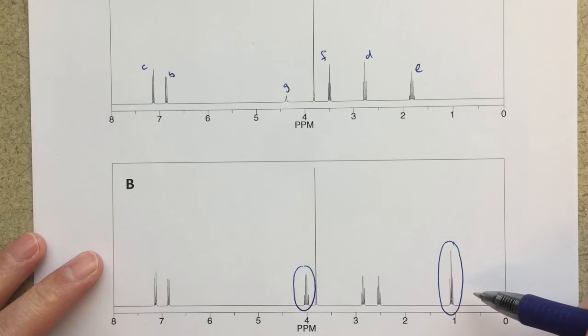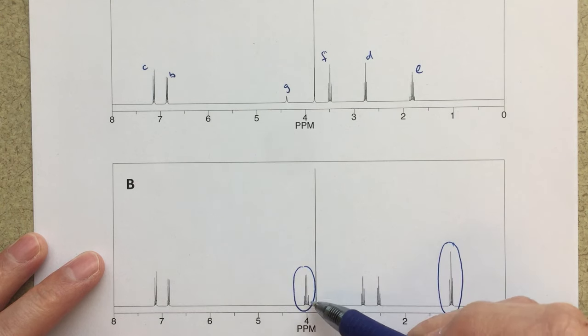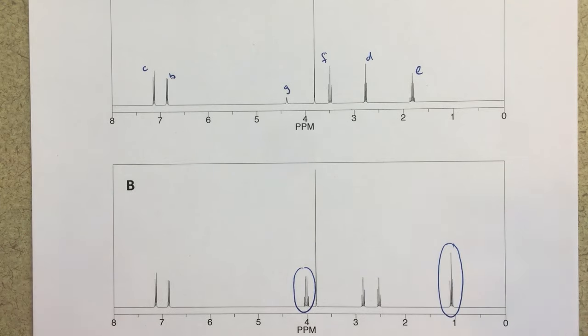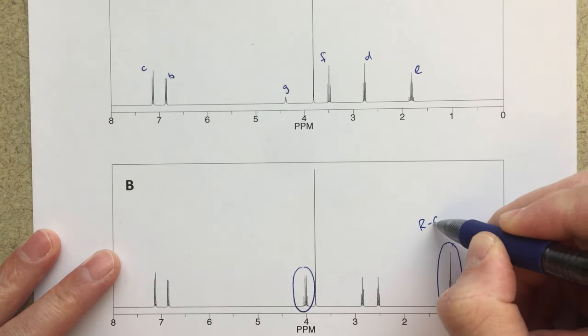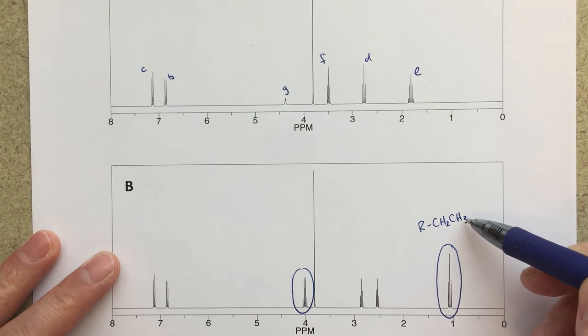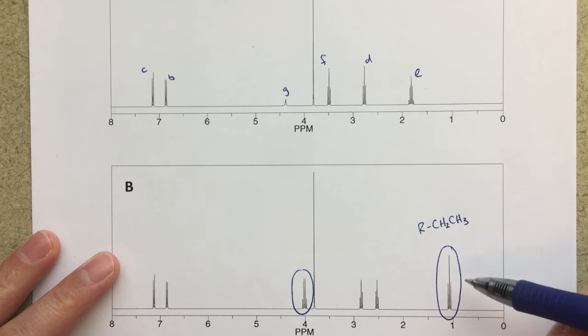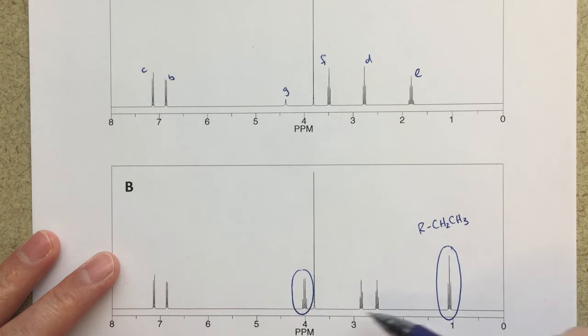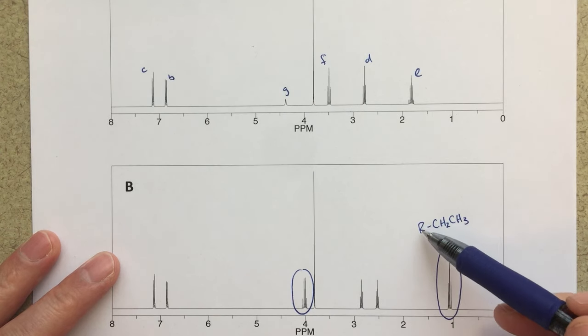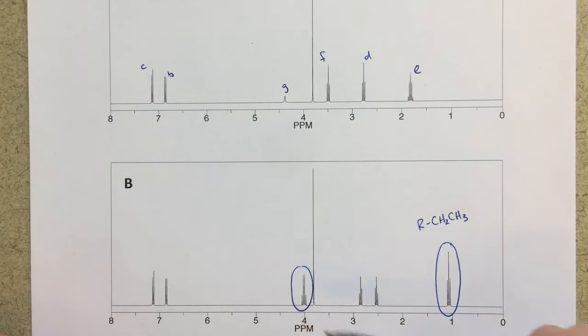We definitely have shifted a little bit, but this peak over here is again also very clearly a new peak. Now looking at these two peaks, again I see a three H triplet, and I see what looks to be a two H quartet. Anytime you see this sort of triplet quartet motif, to me that says right away an ethyl group CH2CH3, where this three H peak would integrate to, would be a triplet because of the splitting from the CH2 group, and then this two H group, it's a little bit shorter, a little bit smaller, should integrate to two and also be split into a quartet from the CH3 group.